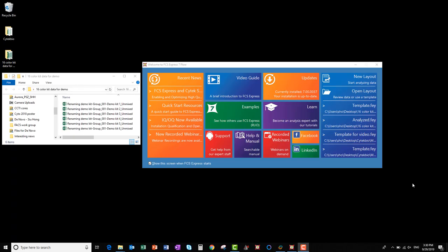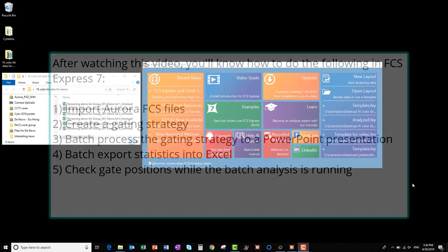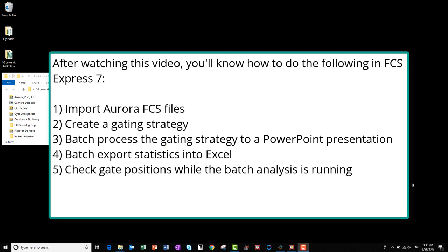In this video, I'm going to show you how to use FCS Express to analyze multiple unmixed FCS files from our 16-color demo kit generated on the Cytek Aurora. After watching this video, you'll know how to do the following with FCS Express 7: import Aurora FCS files, create a gating strategy, batch process the data into a PowerPoint presentation, batch export statistics into Excel, and check gate positions during the batch processing.